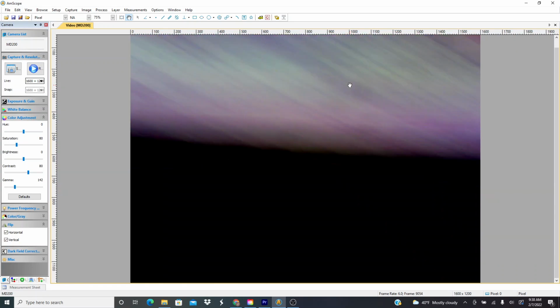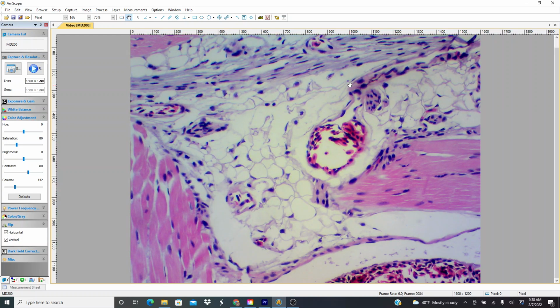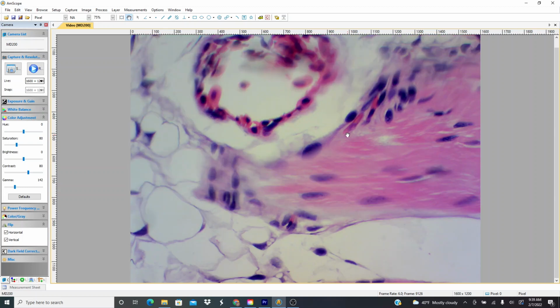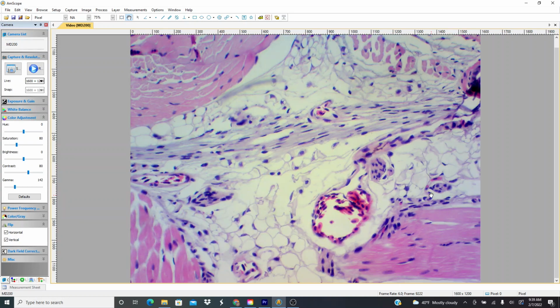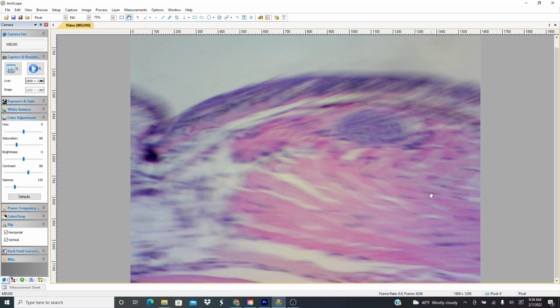This right here, this is kind of cool. This structure here, that's kind of cut in cross section, was a blood vessel. And you can tell because it's got these red blood cells floating in it. These cells that line the blood vessel are called endothelial cells. These are red blood cells. And they do not look like human red blood cells for sure. It wouldn't take long for somebody who knows better to see that this is not human tissue.